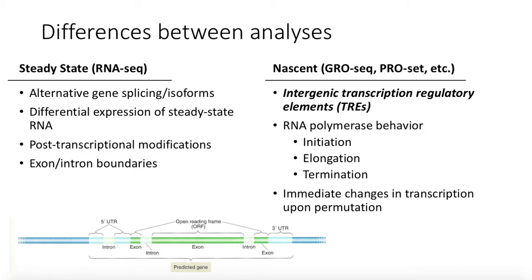So let's say you treat a certain cell with a drug. Really, it takes at least 40 minutes for the shortest gene to be transcribed and translated into protein. And so any data that you get that's under 40 minutes really is representative of the immediate effects of whatever that perturbation was, or whatever that drug was, whatever that hormone was. So you can see really, really short-term effects of these different perturbations.